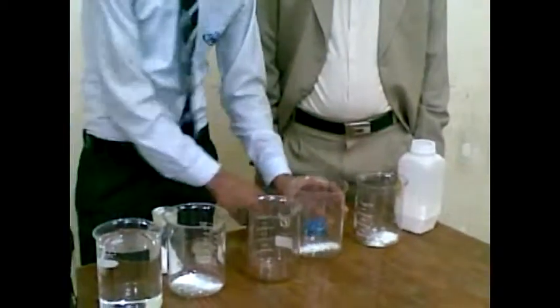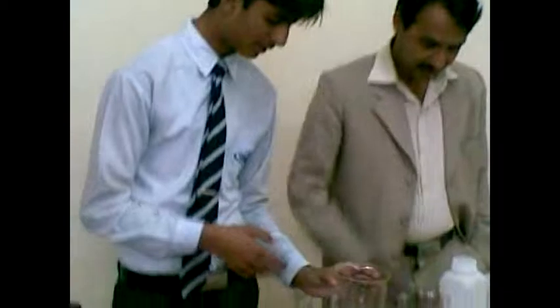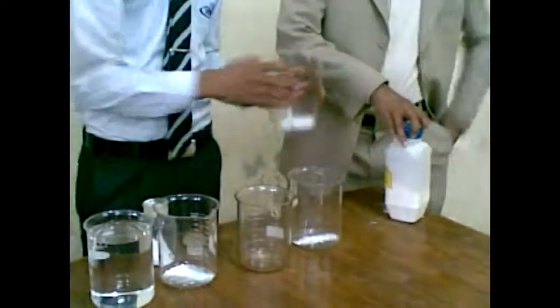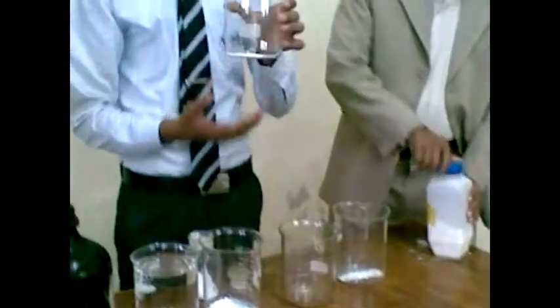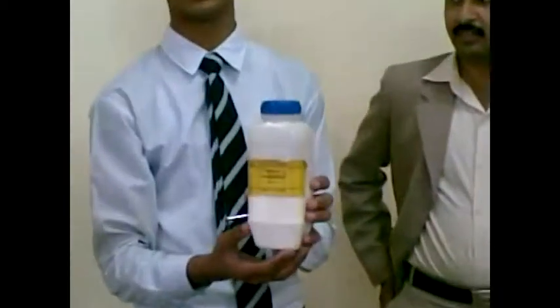And now, in the fourth beaker, it is an indicator. It is also not clean — it is an indicator.